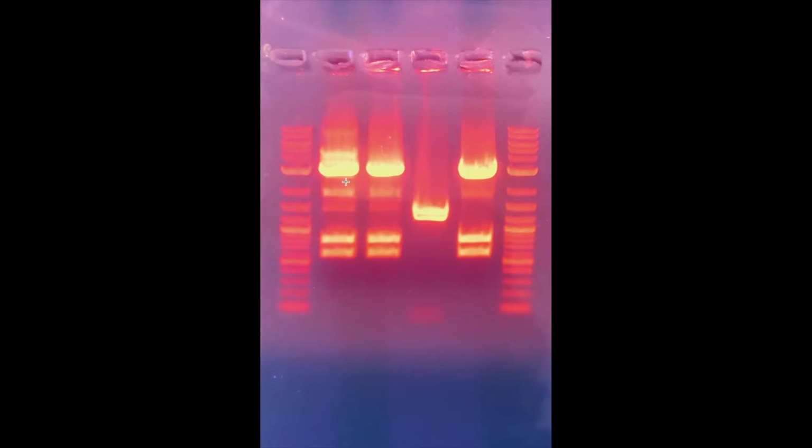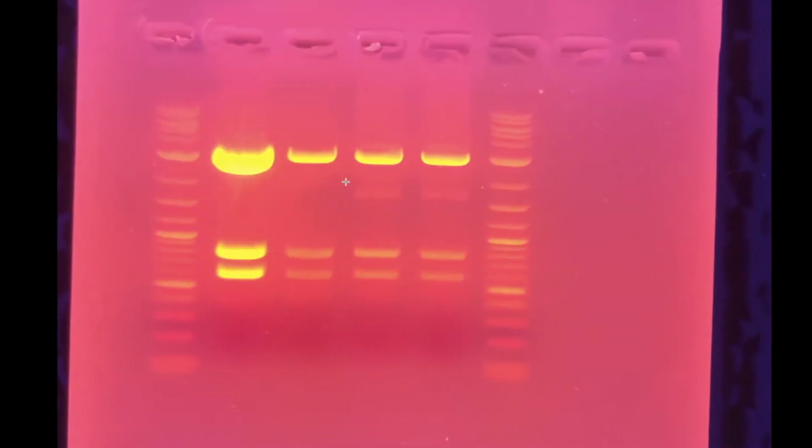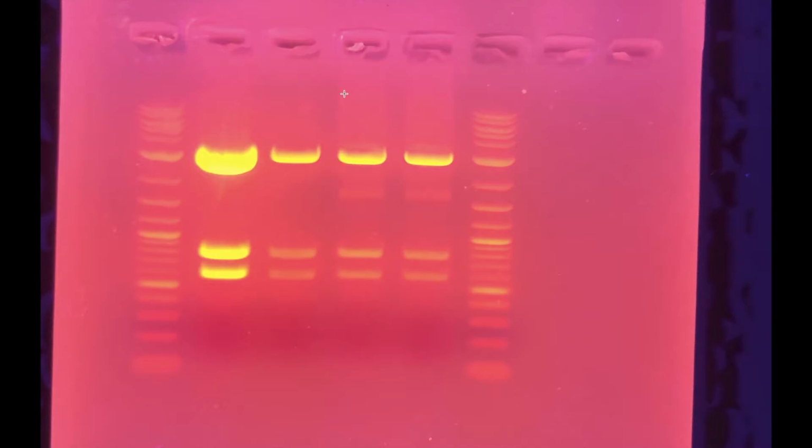I thought, okay, maybe it's some kind of plasmid contamination. Maybe I have 2 plasmids there. Maybe my plasmid did not assemble properly, and additional bands can appear, of course. However, what enlightened me, so to say, was this gel right here. I did 2 different preps and put them on the same gel, digested with ASE1 as I did before.